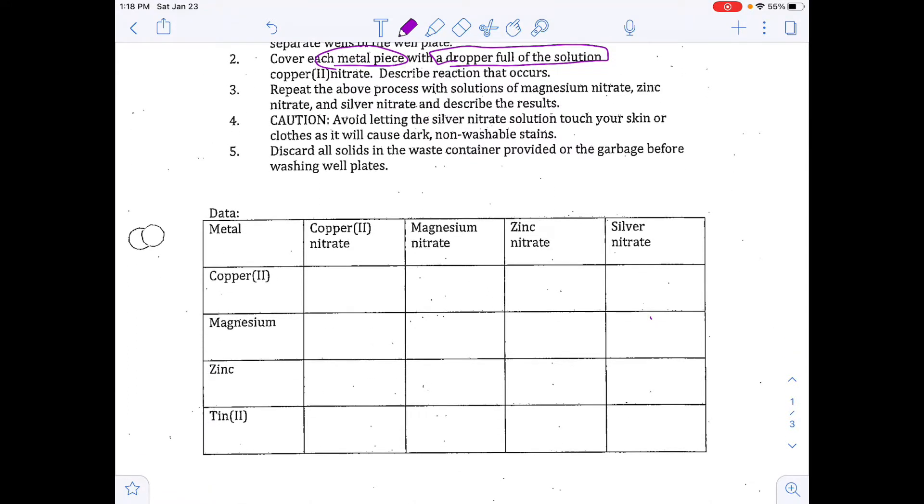We're going to have copper in the first row, magnesium in the second, zinc in the third row, and tin in the fourth.